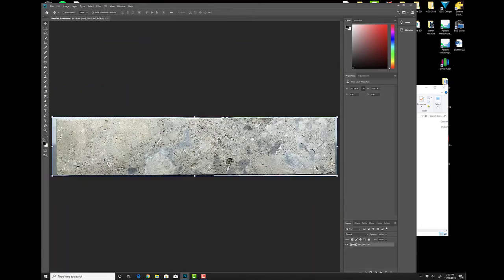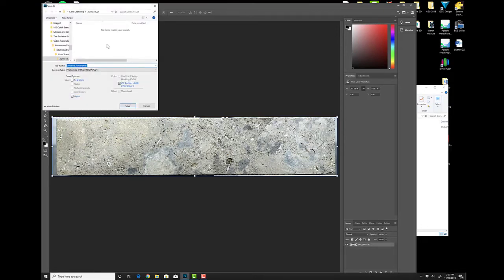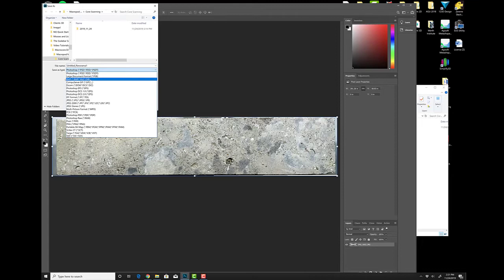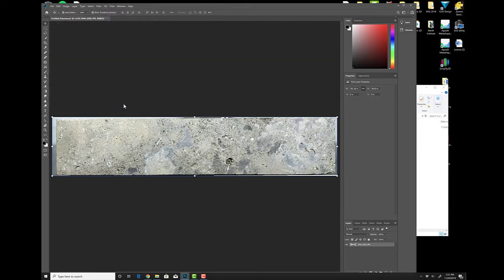So just to bring that back, what we can do then is save that overall file. So we're just going to Save As, and we'll just save it to that original file in core scanning. And we can use it later as a reference just to describe some of the techniques we're going to be using as we do XY scanning. So we'll just save that. We're going to save it as a JPEG. No sense in saving it as a big TIFF or anything. It's not significant for anything else other than this demonstration. We'll just call it Panoramic, and save, and save.